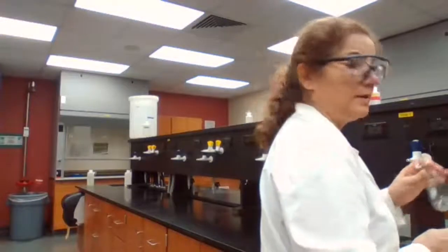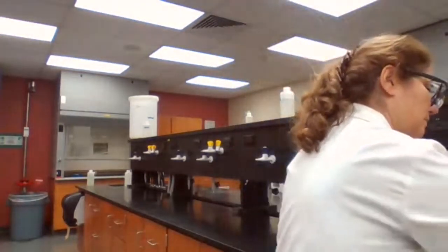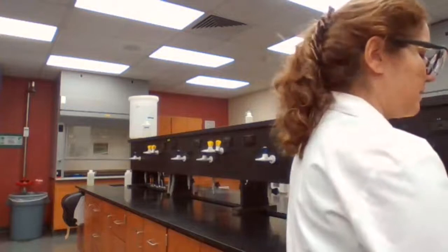That is very tiny. 0.2 grams. Easier on the paper.